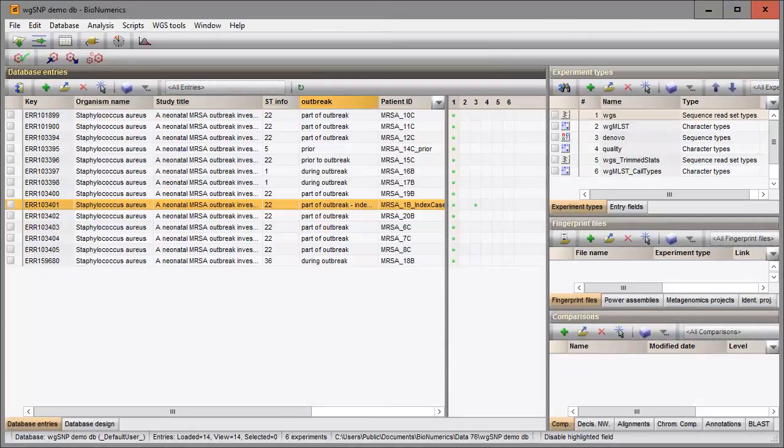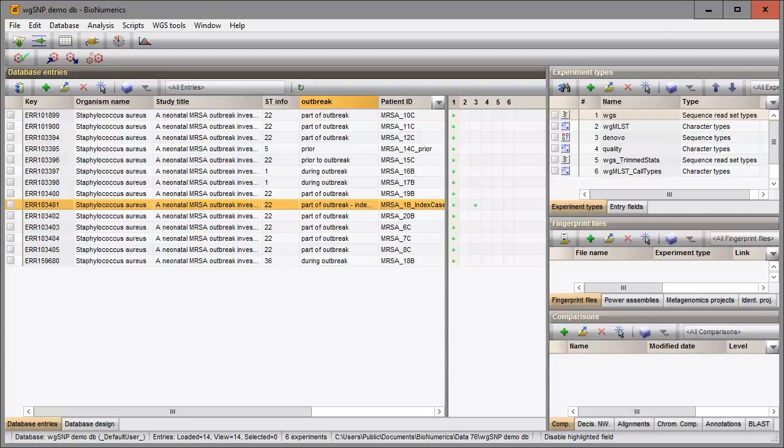In this video I will show how to select a reference sequence for your whole genome SNP analysis. The choice of a reference sequence is very important since only genomic information that is shared between the reference sequence and the sample sequences will be included in the analysis.